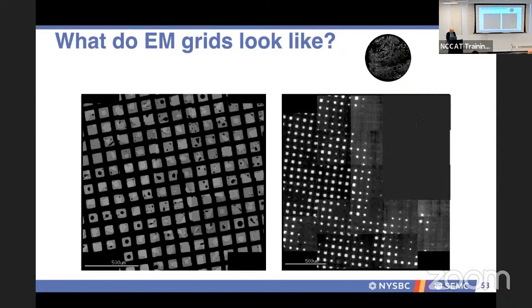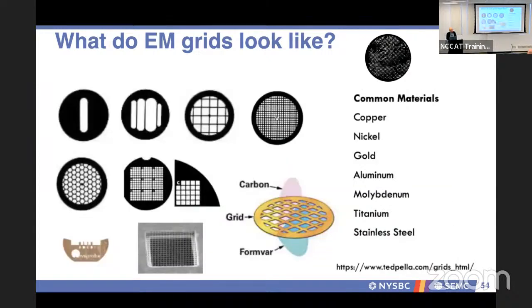For convenience, I would say the left is more challenging for data collection because I can't automate it, and it might be a little more manual. I would prefer maybe something on the right, even though half of it's too thick, because I have more real estate. But at this mag, I can't even tell, because if you look at all those squares and they're all cracked and fractured, that might also not be convenient.